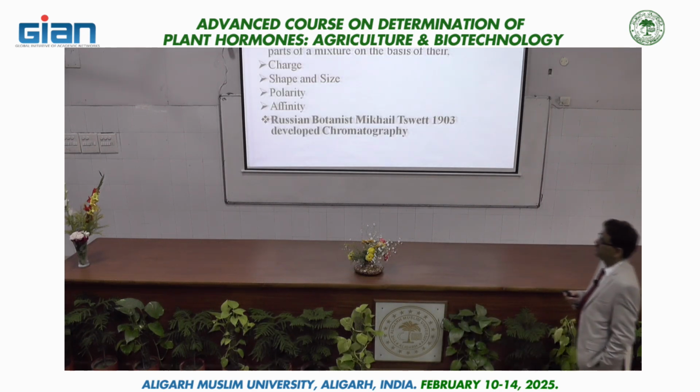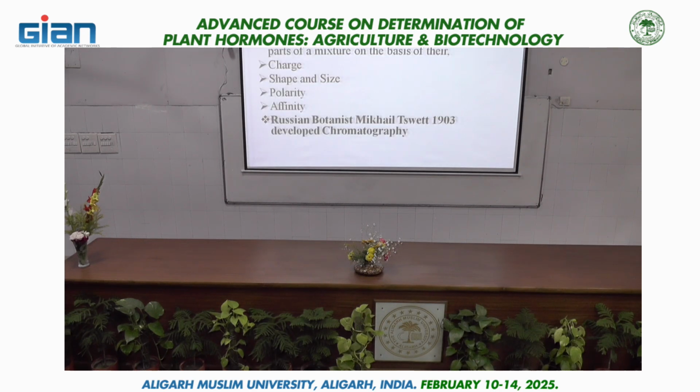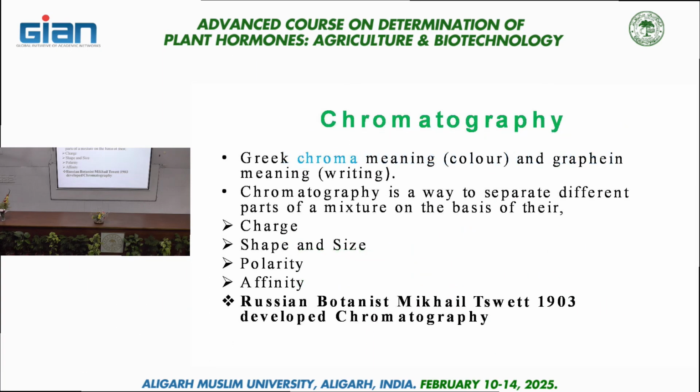So, first, what is chromatography? It is basically from the Greek, chroma meaning color and graphein meaning writing. Chromatography is basically a way to separate different parts of a mixture on the basis of the factors responsible: one is the charge, then shape and size, polarity, and affinity.